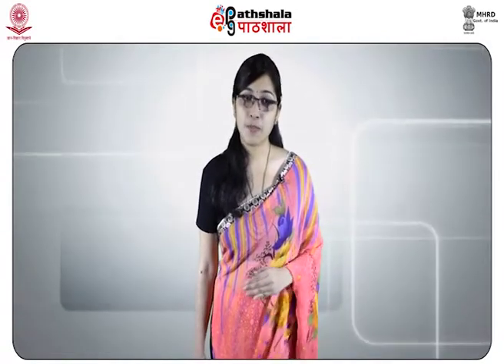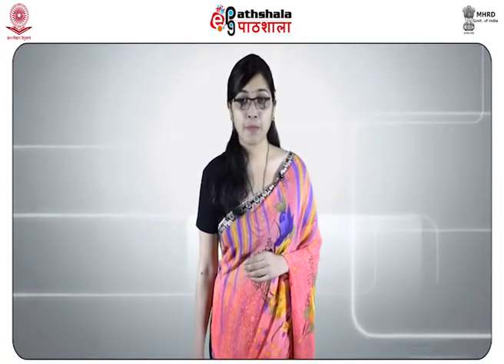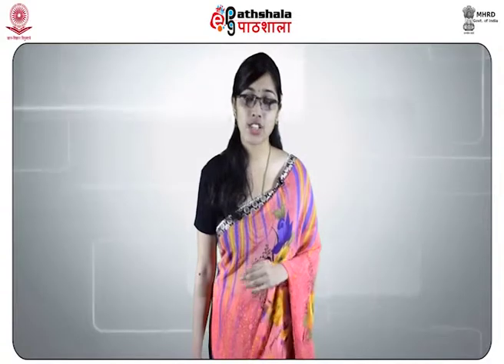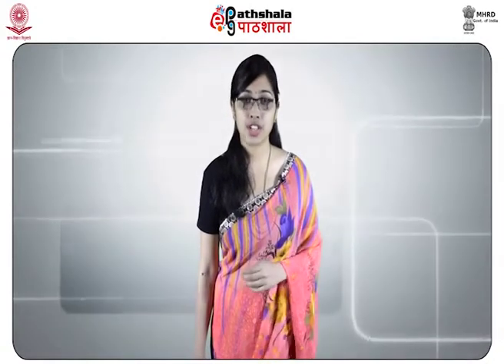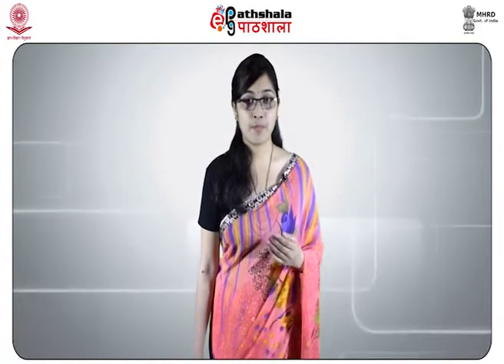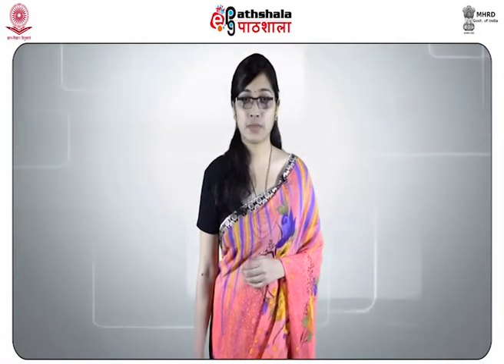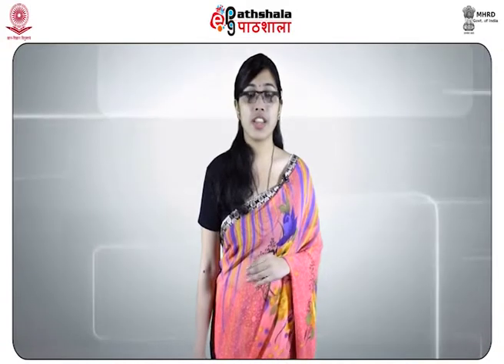Microtomy is helpful to determine the pigment distribution, medullary shape and medullary index of the hair. In human hair, the pigment is found concentrated near the periphery of the cortex, close to the cuticle, while in mammals the pigment concentration is near the medulla and in the cortex. It also permits proper study of the shape of the cross-sectional area.